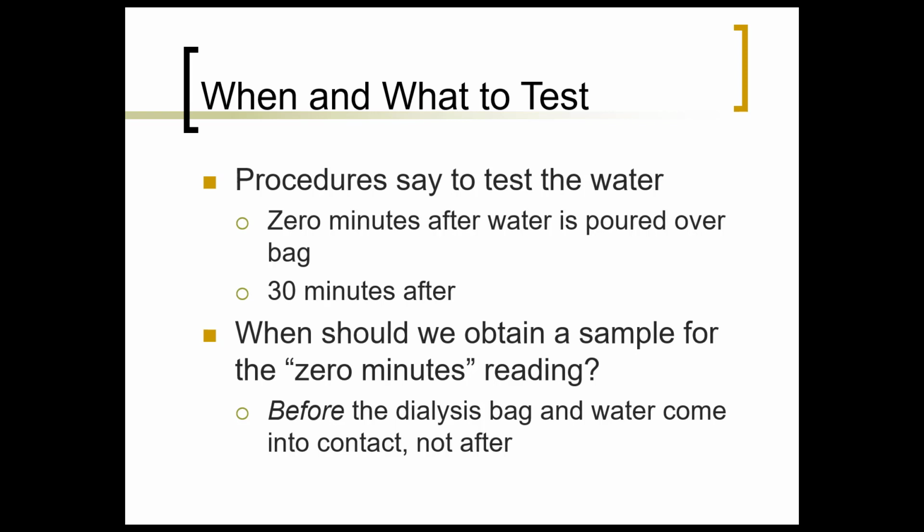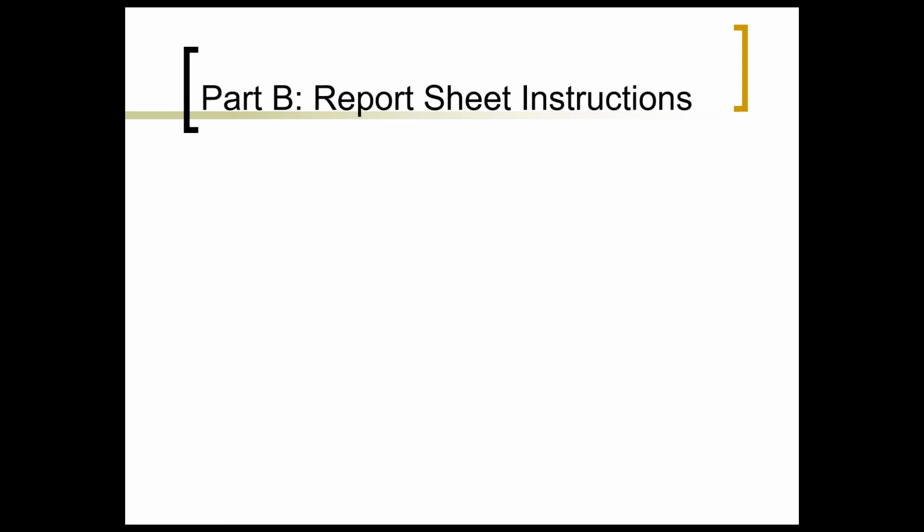For that reason, I have changed the procedure so that the sample tested at 0 minutes was taken before the dialysis bag ever came into contact with it. I then test the water after 30 minutes exactly as the procedure tells us we should. Finally, I test the leftover solution in the dialysis bag to see which solutes, if any, remain.